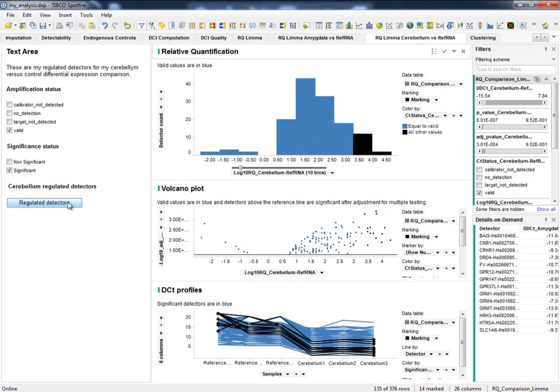Okay, this tutorial is almost finished, and we know now how to export our analysis to different formats and even save the analysis into our own TIBCO format. But is there any way to share my analysis and keep the powerful filtering tools? Third-party formats are unable to provide such functionality, and TIBCO project is limited by the user having their own TIBCO license.